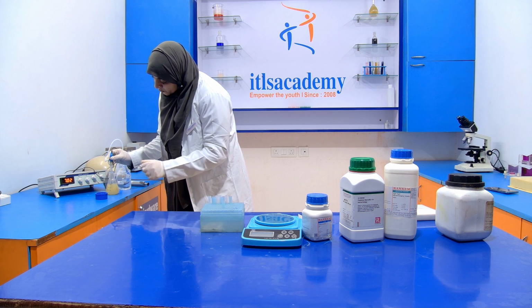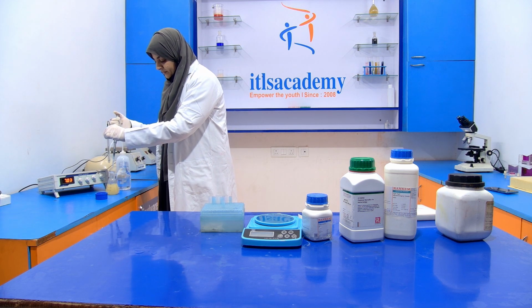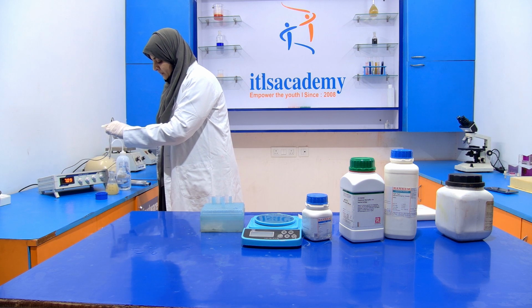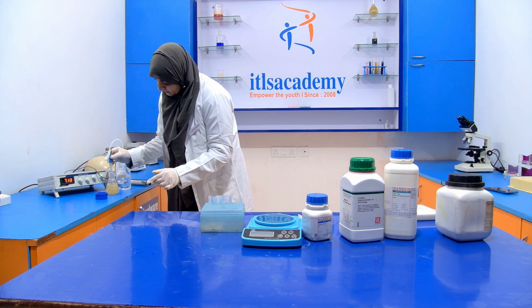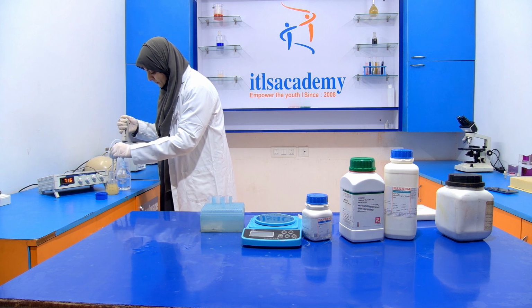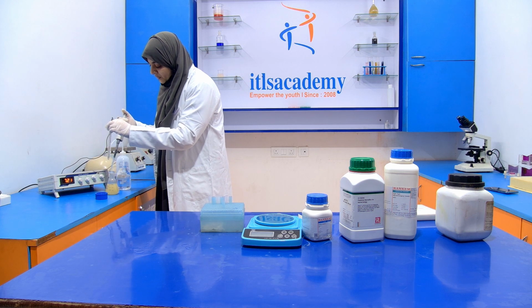It is 7.02. Again, we have to add NaOH into it. Again, its pH has not reached 7.4, so we have to add more NaOH into it.